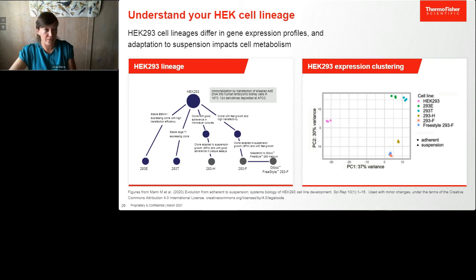With the picture on the left, I'd like to highlight the uniqueness of HEK 293 cells, which would look comparable for CHO cells. Since the original 293 cells were derived from a human kidney by transformation with adenovirus 5 DNA, a lot happened and multiple variants of it have been created. On the left, the blue dots on that picture represent adherent cells, whereas the gray dots represent suspension cell lines. Those are on the bottom on the right.